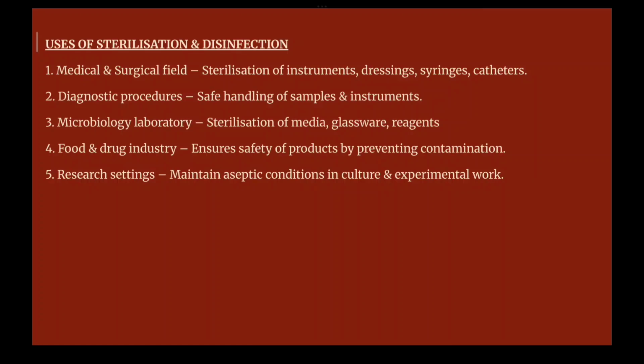So the bacterial infection can come from outside to inside or from inside to outside of the laboratories. So it is essential to keep the area in aseptic condition. There are going to be air conditioning systems that are going to circulate the infected air outside, and there is strict vigilance about the PPE kits, that is personal protective kits, in the research settings.